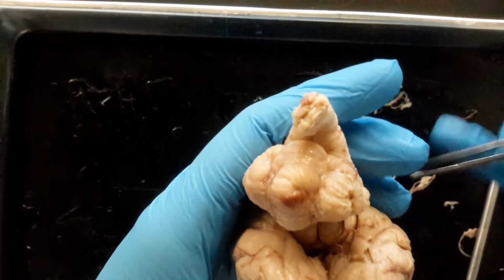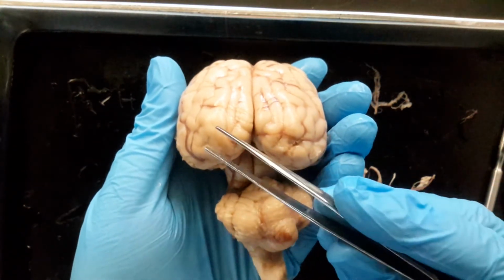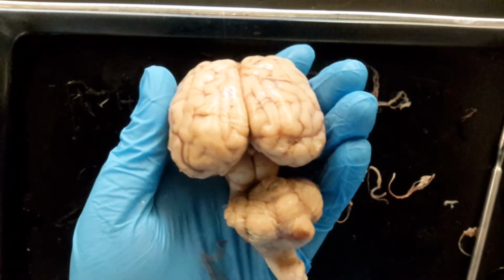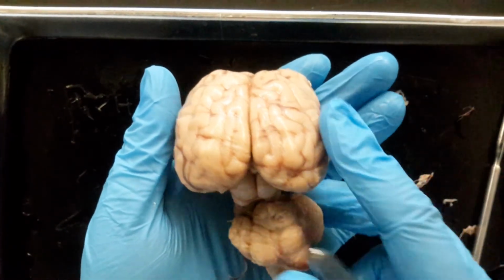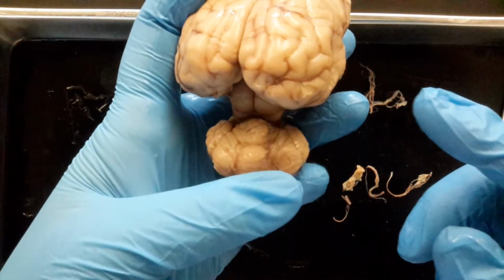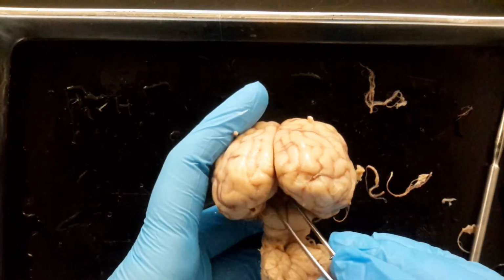The pia mater. At the base, I'm going to turn this guy around. Sorry. But at the base, here are our occipital lobes again. You will have some connective tissue here. You're going to need to clean it away, nice and gentle, in order to view some structures. So I'm going to show you, this one's nice and clean. I'm going to hold the brain between my fingers here and very gently pull down on the brainstem and the cerebellum. Very gently, because some of these are fragile.